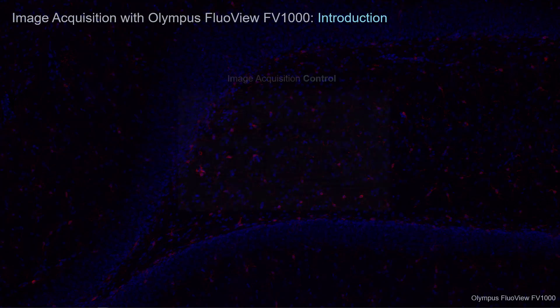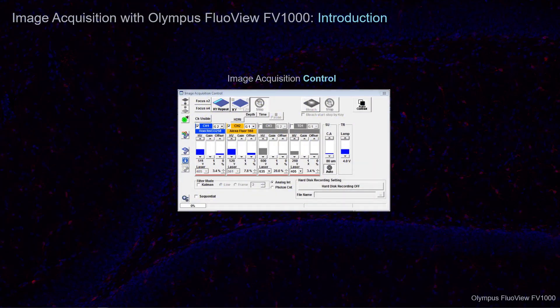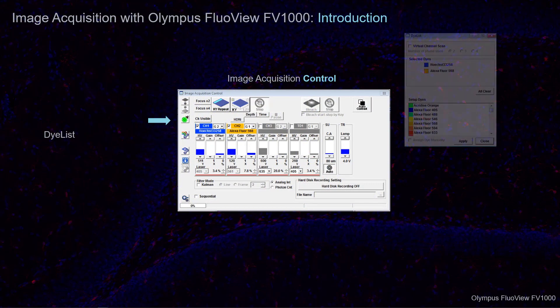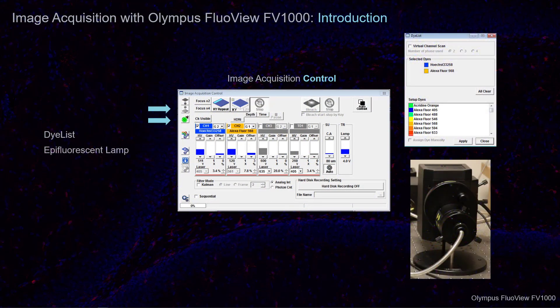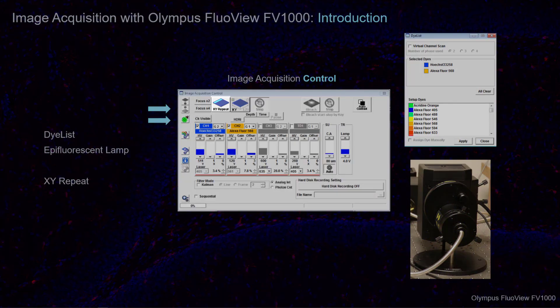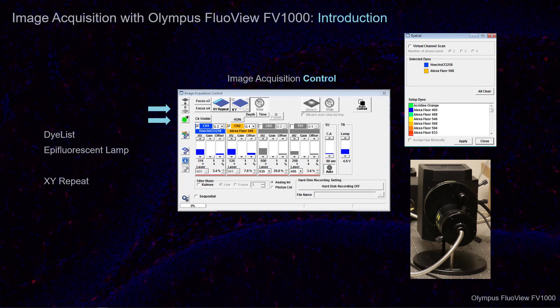The Image Acquisition Control window is where you can access the die list containing setup dies and the switch to turn on and off the epifluorescent lamp. This is also where you select the XY Repeat button to generate the Live View. When you have done so, you can then fine-tune the quality of the live image by adjusting the acquisition parameters. This will be covered in more detail in tutorial 2.